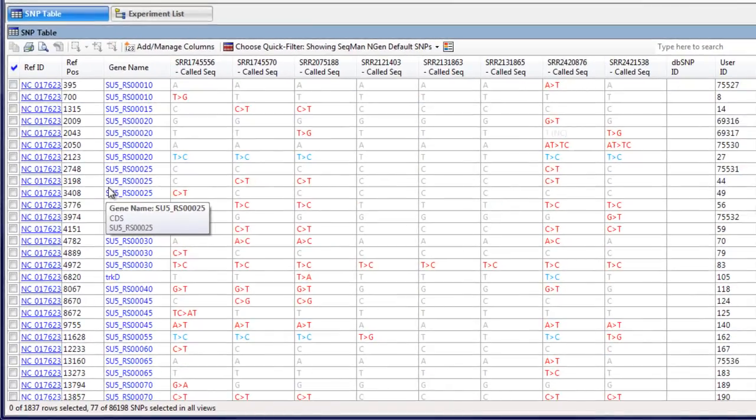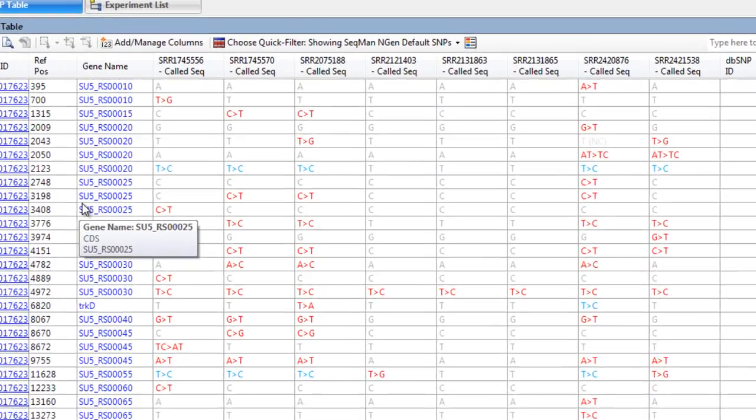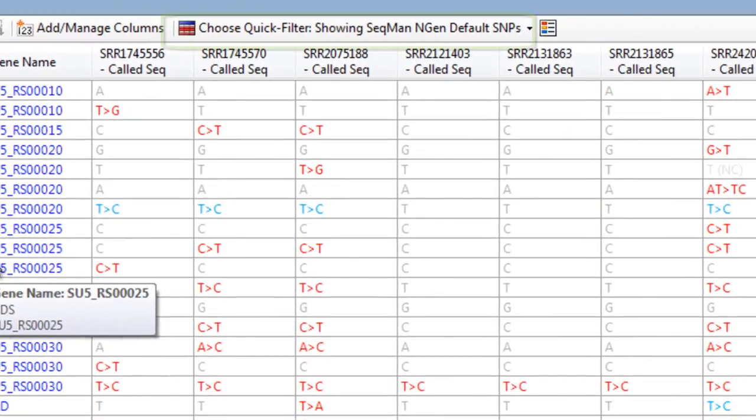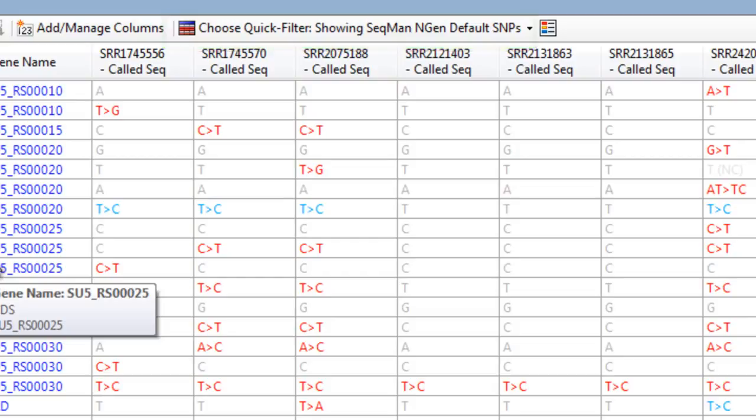By default, this list is filtered to show only SNPs from the VCF file that also meet the SNP criteria specified during assembly setup.